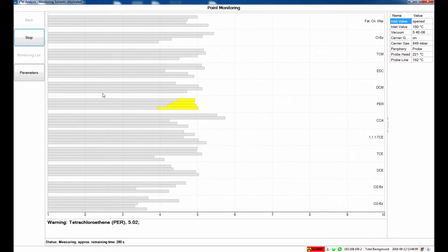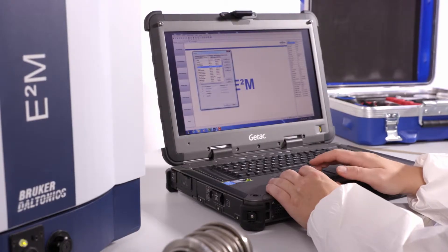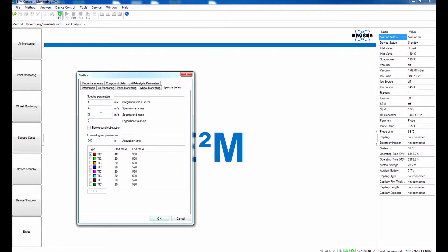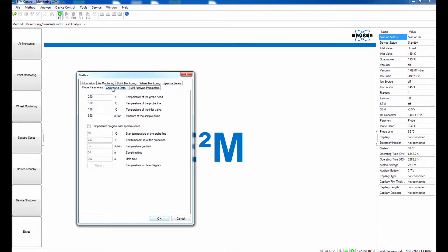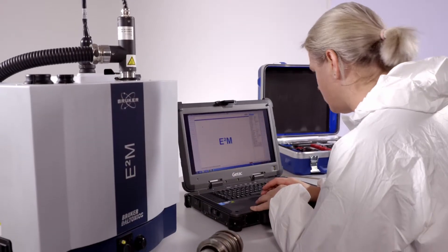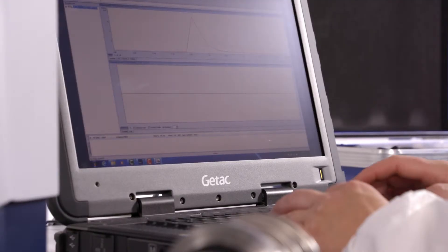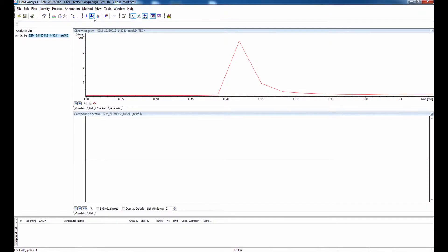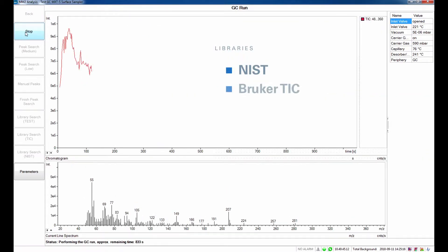The E2M is operated by two software modules for instrument control and data acquisition. The E2M control software is designed for advanced users, allowing all parameters of the instrument to be set and new applications to be created. Both software tools include fully automated data evaluation based on the National Institute of Standards and Technology Spectra Library and the Bluka Toxic Industrial Compound Library. Customer-specific libraries can also be used.